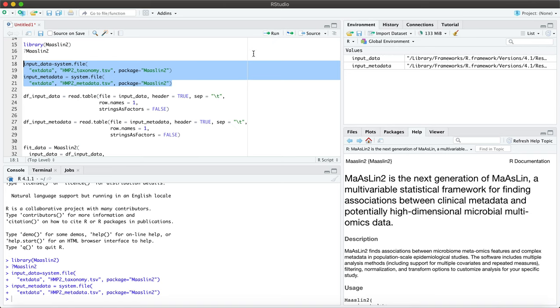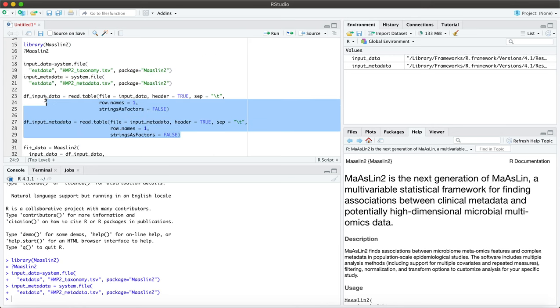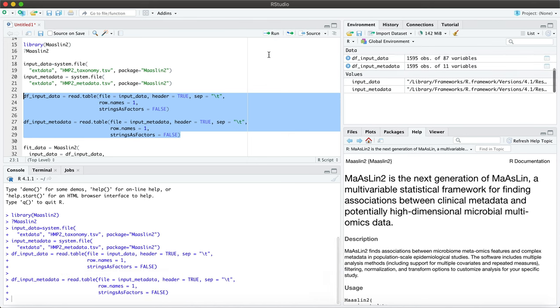Okay next we want to assign data frames to both these data sets and we'll call these df_input_data and df_input_metadata. One data frame for each data set, and you can see that these show up here under my data view.